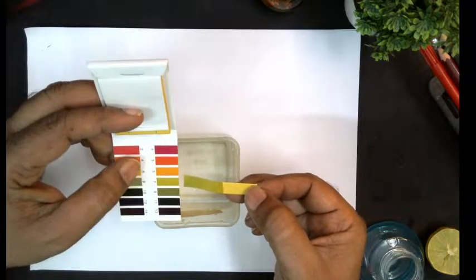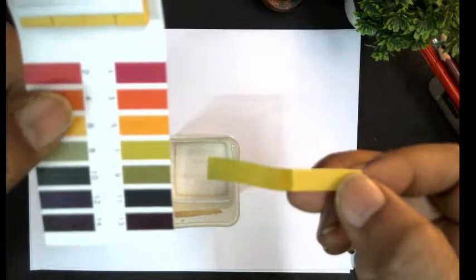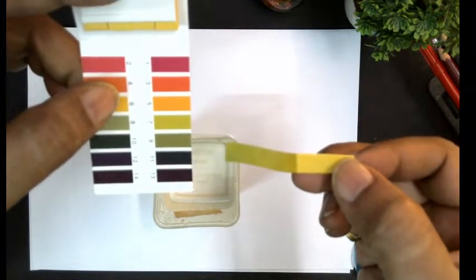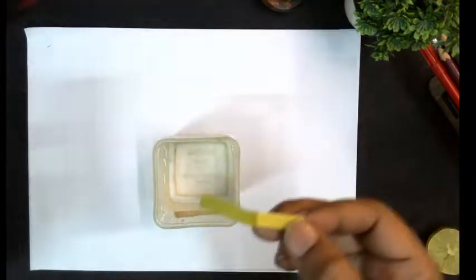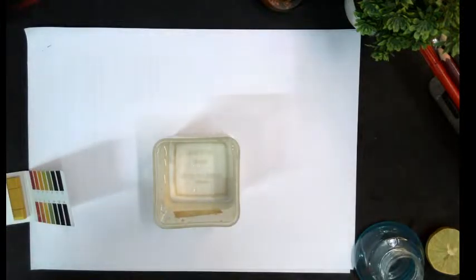Are you able to follow this? You got the indicator. Right? So this is 7. pH is 7. This color matches. We can take this as water. Being water, the pH is neutral, that is 7. Okay, right. And let me check the lemon.